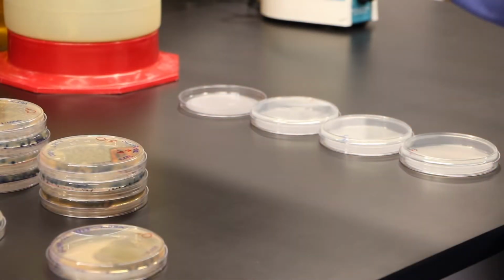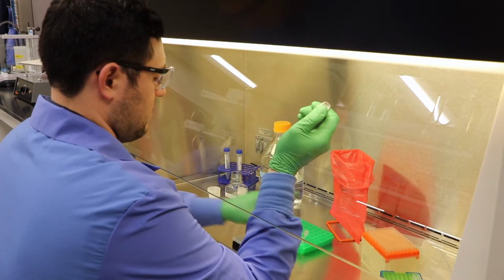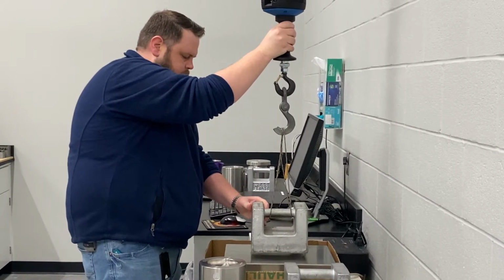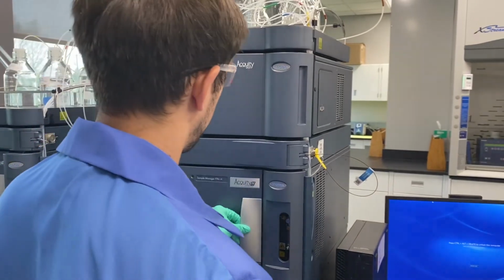Thanks for joining our tour. The KDA Laboratory performs microbiological, chemical, and metrological testing to protect public health and safety, safeguard animal health, and protect consumers from economic fraud. Our test results are used by KDA regulatory programs in the Division of Agribusiness Services.